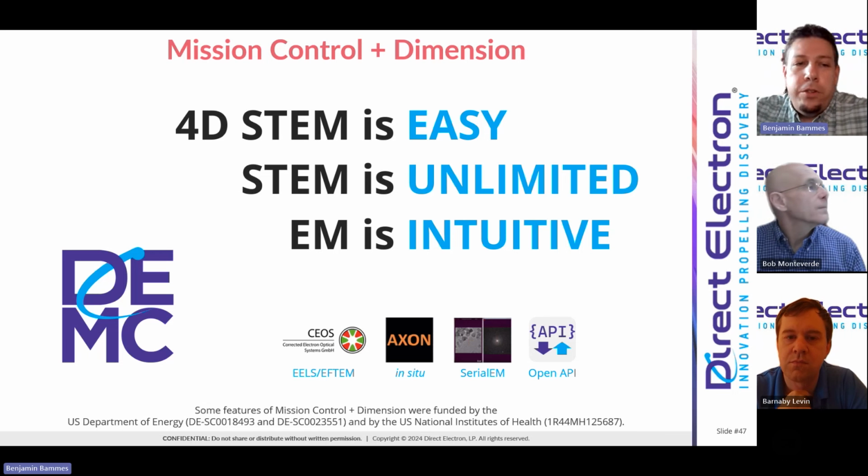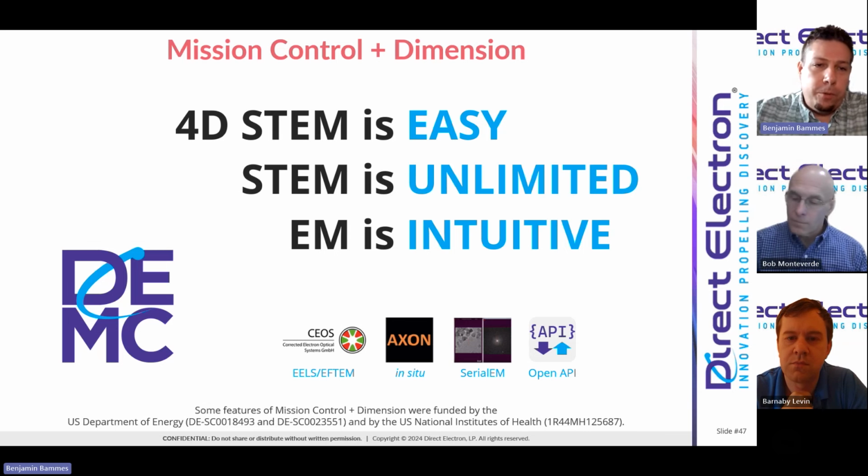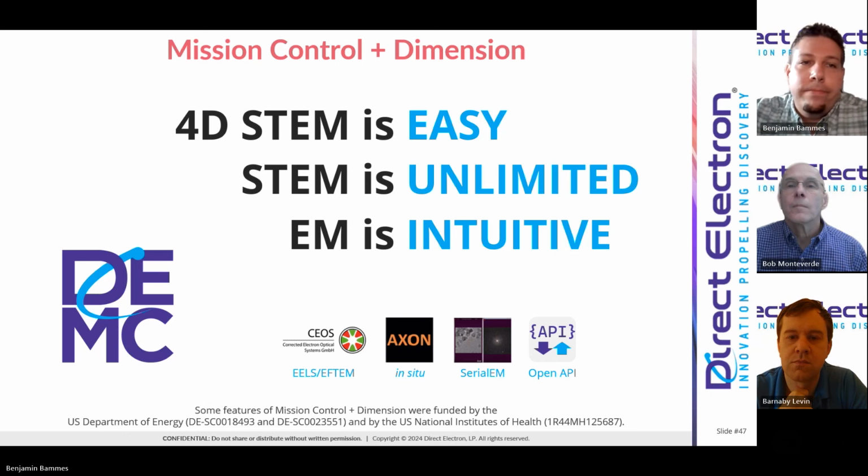However, many of the features of doing virtual imaging and things like that do require the FreeScan because we have to know where the beam is to calculate a virtual image. And so for the 4D STEM features, you really do need the FreeScan to take full advantage of the entire feature set. For controlling our cameras and all of the other features that we showed, especially towards the end, the FreeScan is not required.